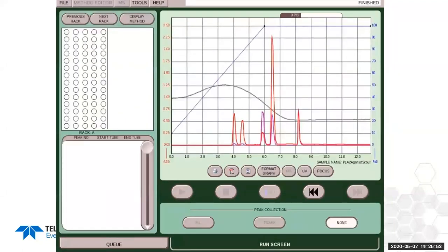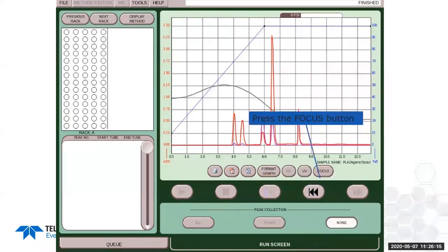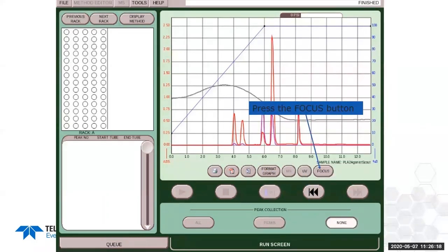Running the scouting method with five components, we get baseline resolution between all of them — but keep in mind this is a scouting run with low injection volume and concentration, so we're not loading a lot of compound. When the run is done, the focus button appears. This button is only visible when you've done a scouting gradient; if you haven't set it up properly in the configuration screen, it won't appear.